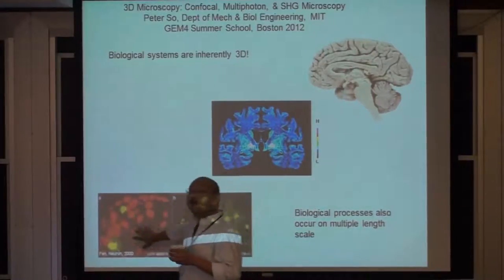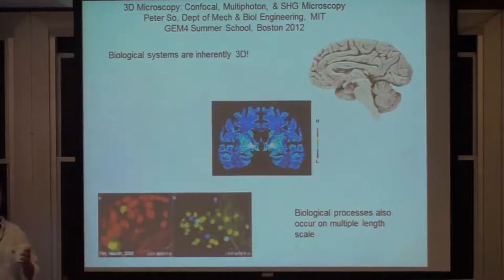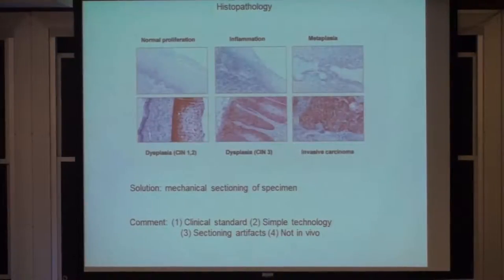And then even if you are studying single cells, if you want to resolve the structure within a cell itself with submicron resolution, the cell itself is a three-dimensional structure.